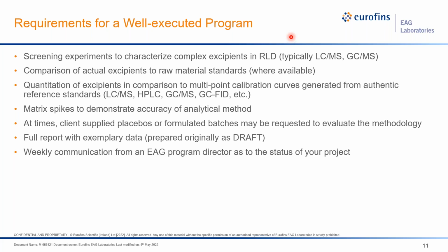If you send us a placebo or formulated batch and don't tell us what's in it, it's really just doing two deformulations at that point. We're looking at the RLD, which is unknown, and your placebo, which is unknown. So that's why we ask that you would share that information if you want to move forward with the project, to make this successful. Then we also look at the report.